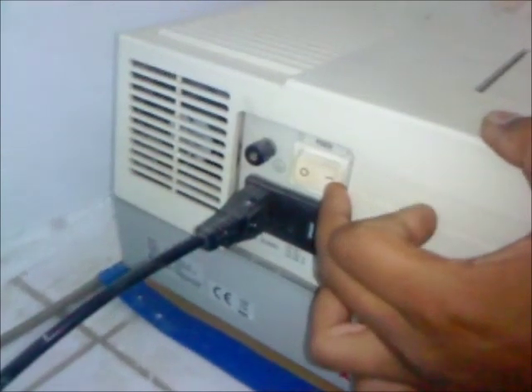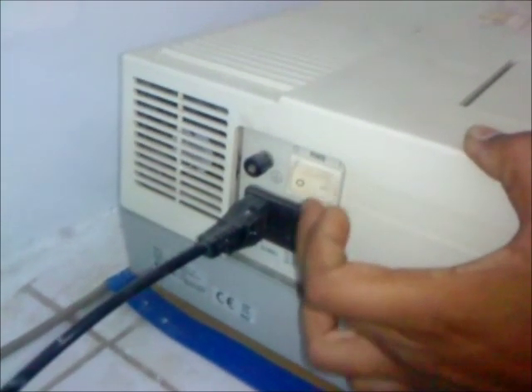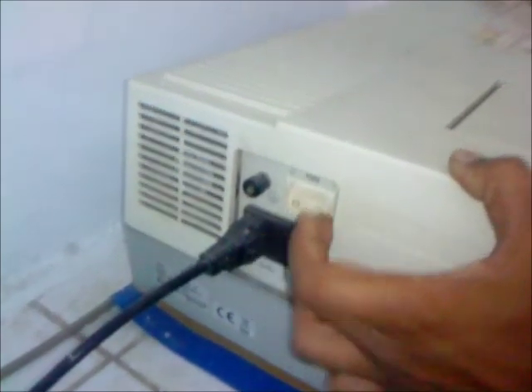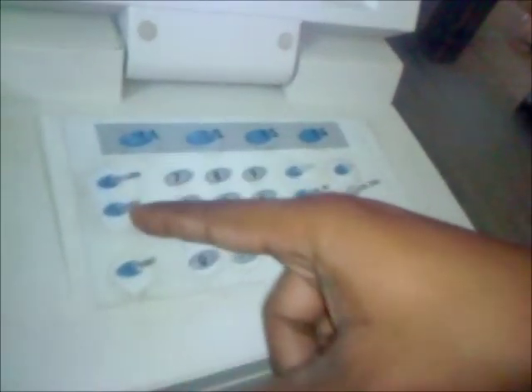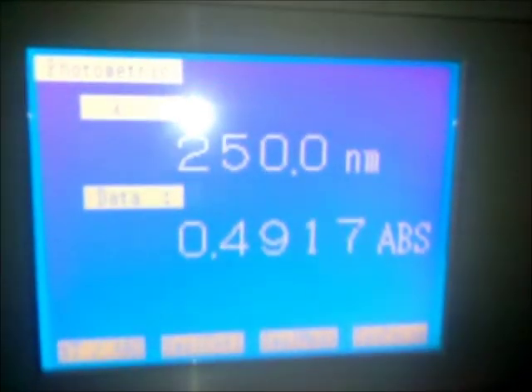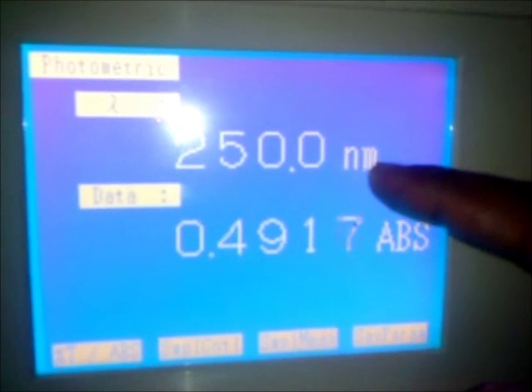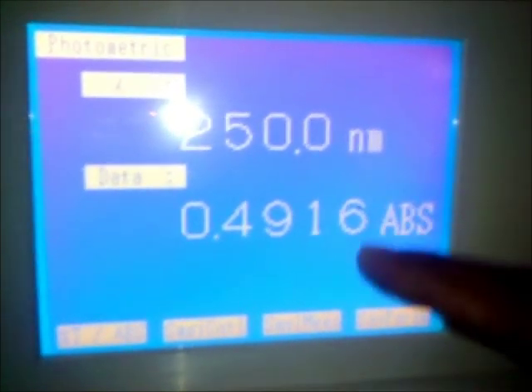This knob is specialized for switch on and switch off. These are the various keys: these are for return, these are for mode, these are for print, these are for start, auto-zero, go to wavelength, and enter. This is the display screen showing 250 nanometers wavelength and this is the absorbance.